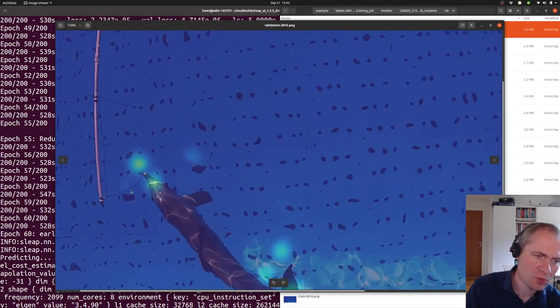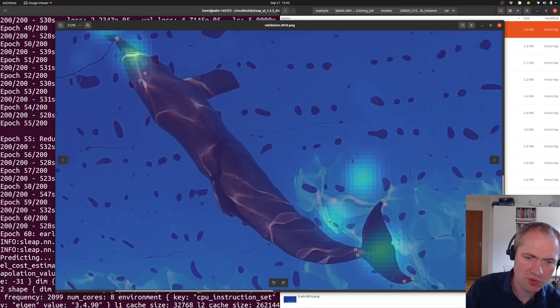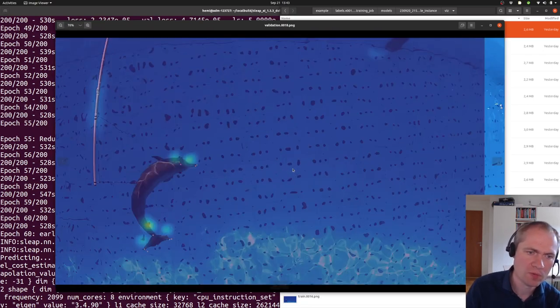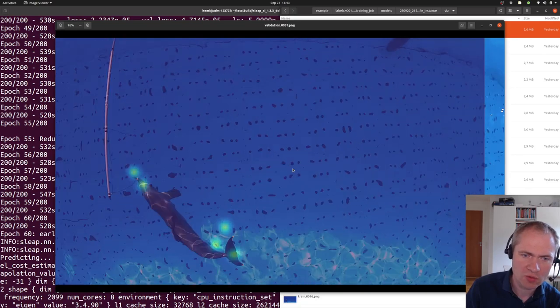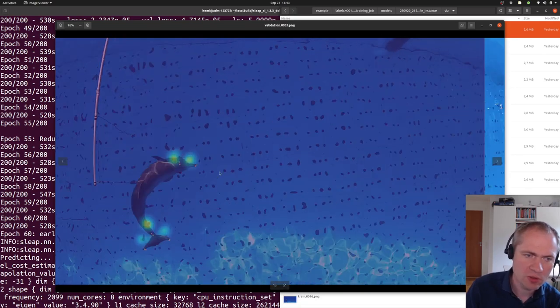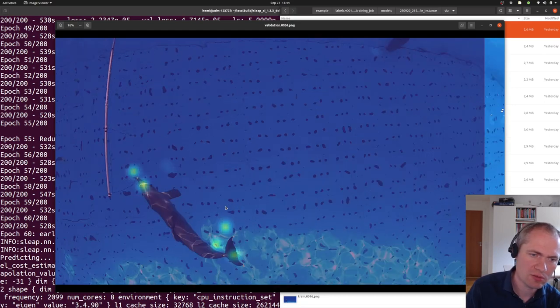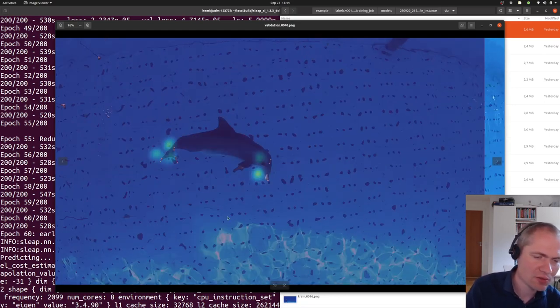And we can see how the estimates actually are improving over time, getting closer. And if we go on a bit more, we can see that they are even better. And it will just continue like that for this.